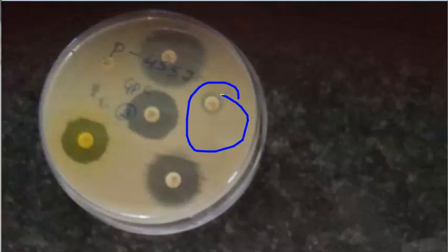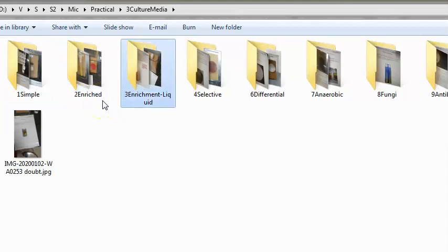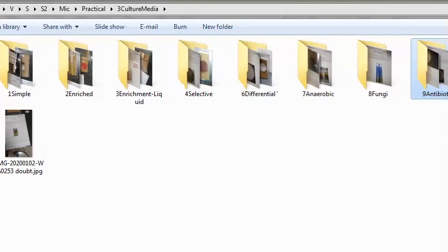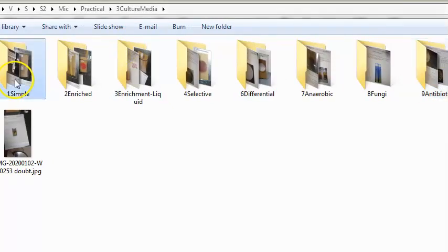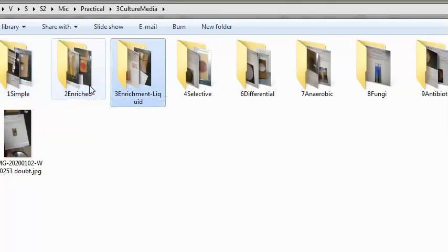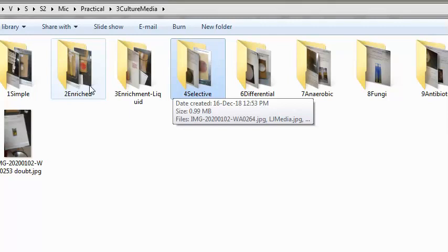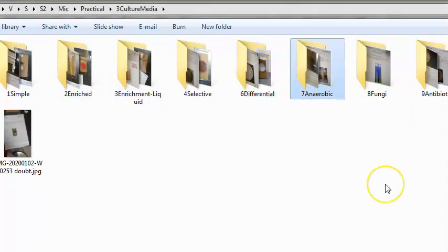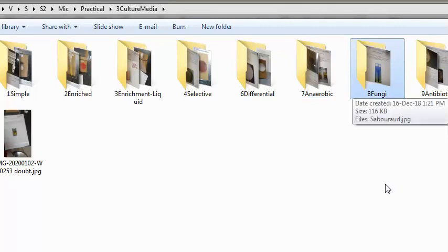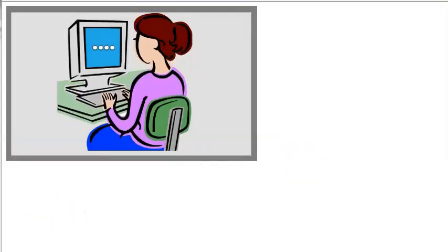In summary, this video covered: simple media (peptone water, nutrient broth, nutrient agar); enriched media (blood agar, chocolate agar); enrichment media (selenite F broth); selective media (WBBS, TCBS, potassium tellurite, LJ media); differential media (CLED, MacConkey); anaerobic media (Robertson cooked meat media for Clostridium); fungal media (Sabouraud's dextrose agar); and antibiotic sensitivity testing on Mueller Hinton agar.